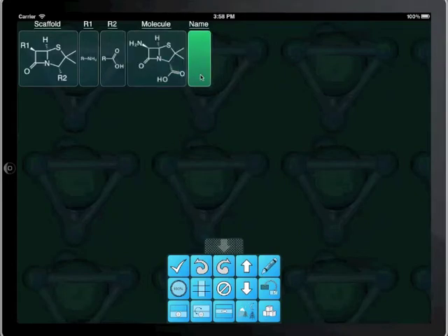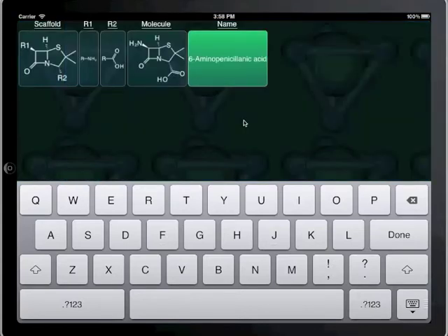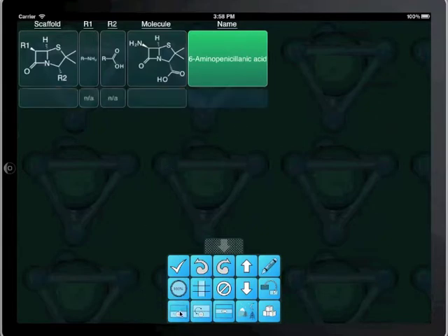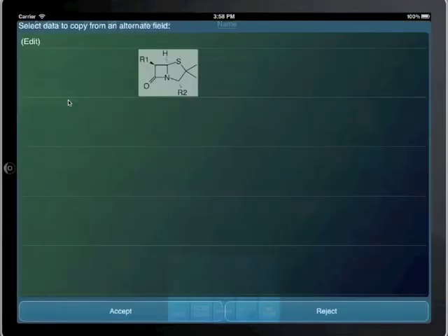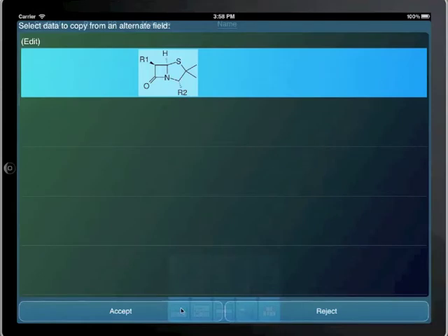Double tapping on the name field gives us a chance to enter the name for this derivative. Now we add a new row for which the values are all blank. Double tapping on the scaffold brings up a list of unique values from other columns, which allows us to reuse the first scaffold.